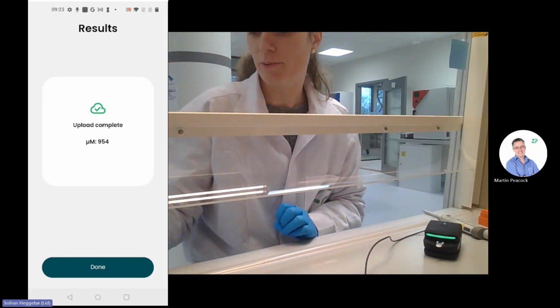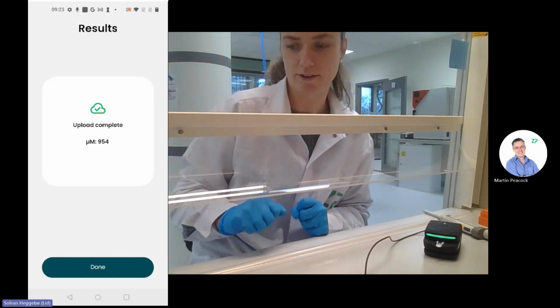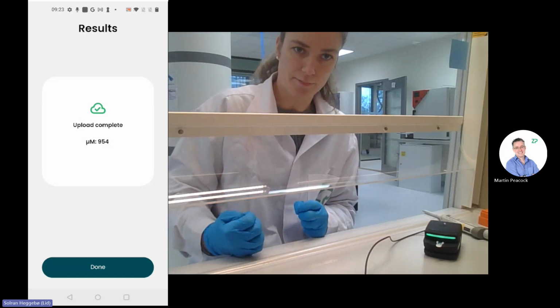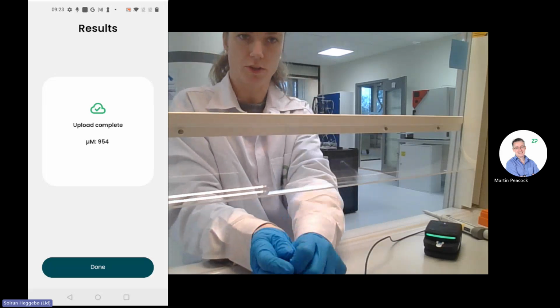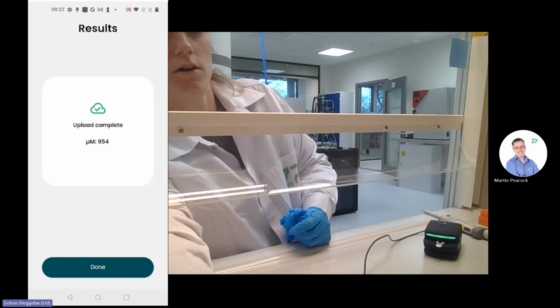And now we have upload complete, which means that the results have been uploaded to Julie, which I will later show you. And then it also gives the micromolarity back, just for like a quick sort of result. So now I will go to Julie and I will show you the results online.